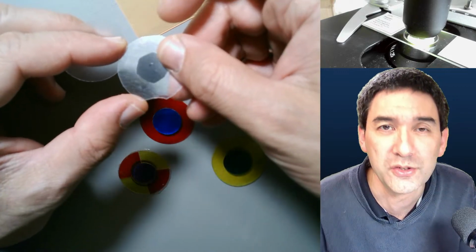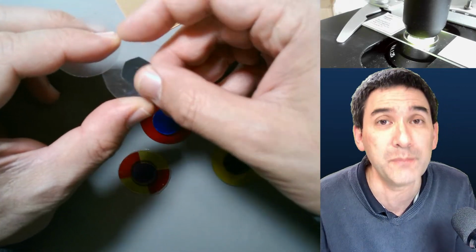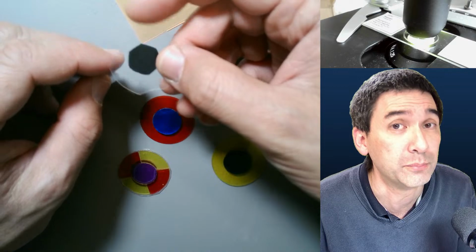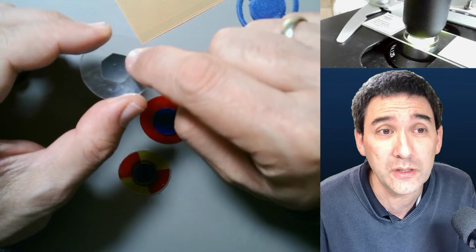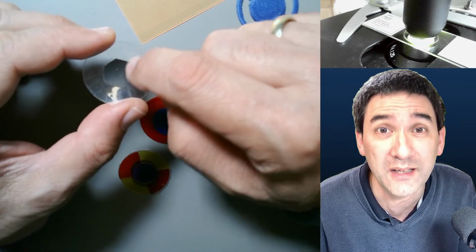Something that you should please not do, I'm just saying this is a little bit of a warning, especially if you have microscopes with halogen lamps. Halogen light bulbs are very bright, and if you completely want to make it dark, theoretically, you could put on a cutout of an aluminum tin can, right?